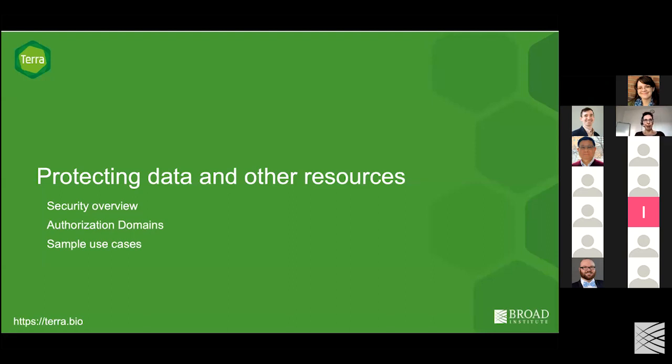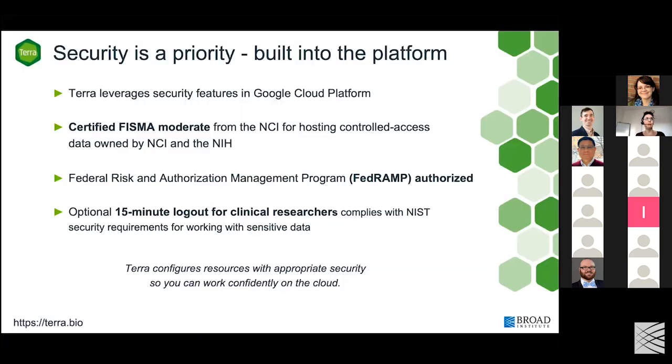So the last piece I want to talk about is how to protect controlled data and other resources. Security is built into Terra, which is nice. Robert talked a bit about how Terra leverages security features on Google Cloud Platform. It's certified FISMA moderate, it's FedRAMP authorized, and I don't remember if you added that we have a 15-minute logout that is a NIST compliance requirement for clinical researchers.